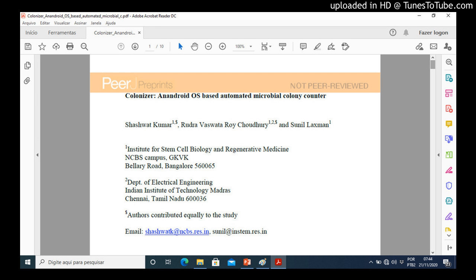Uneven illumination, which leads to uneven contrast in an image, often degrades the threshold separation of adjacent mountain peaks between a valley. To correct this and produce an image with enhanced contrast, the top-hat transformation is applied on an image. Figure 4 and Figure 4A illustrate how the top-hat transform works.